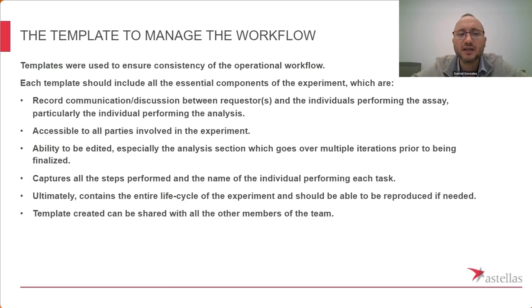And also, we wanted the ability for it to be edited, especially in the analysis section, since the analysis section for RNA-seq experiments will really go through multiple iterations prior to being finalized. We can say, okay, this is what we think the analysis is, are your targets that we found, number of counts. It could be something as small as, we wanted to know what is the differential expression of sample A versus sample B.